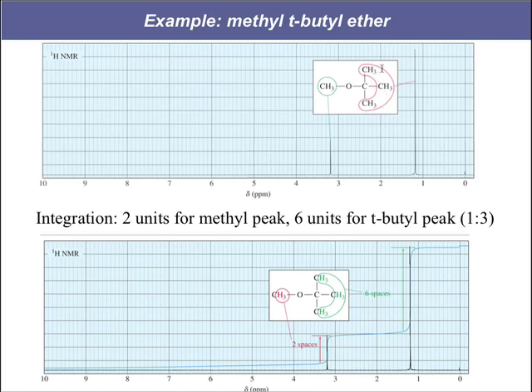We've got 9 hydrogens that are all identical on the T-butyl group. These 3 hydrogens are identical to these 3 hydrogens, which are identical to these 3 hydrogens. So we've got a big peak, but those are going to pretty much be shielded. They are 2 carbons separated from the O on the ether. So normally these methyls, we'd expect them to be around 0.9, but you can see here they're about 1.2. We can explain that shift by being in relatively close proximity to a deshielding atom.